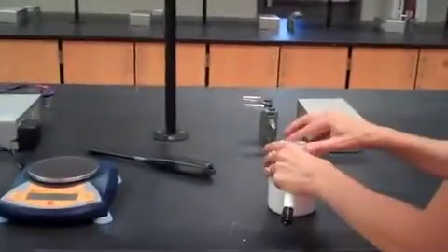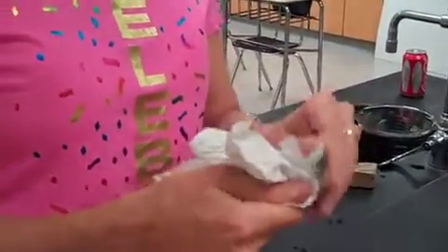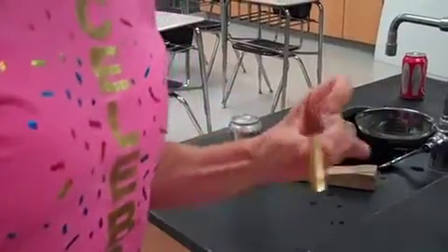Okay, now the last thing we have to do is determine the mass of the metal. Here's the cylinder. And let me dry it off. I wanted the metal in the beaker boiling for a long time so it could reach that boiling point temperature.